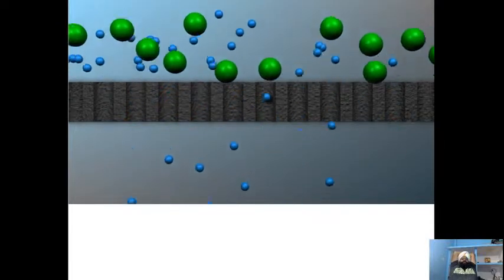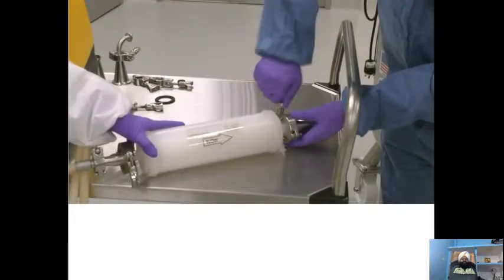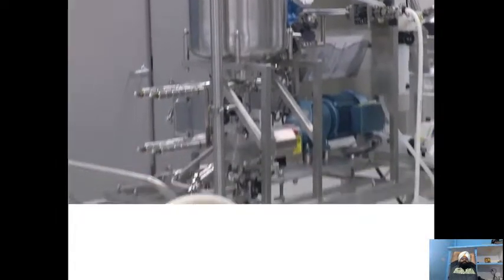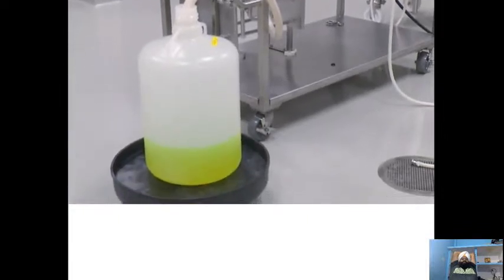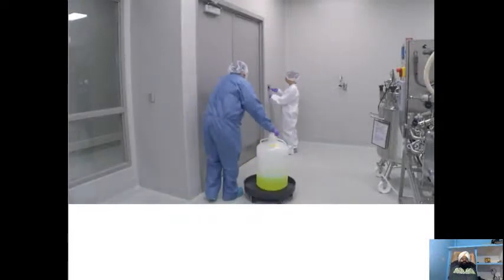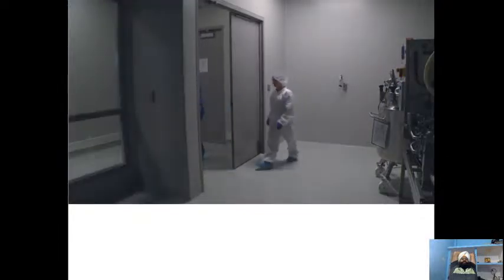When this process is complete, the GFP solution is routed through a 0.22 micron final filter and then collected in appropriate containers, usually bottles or bags. The purification process is complete. The green fluorescent protein concentrate can now move downstream to final fill finish to be freeze-dried and packaged.